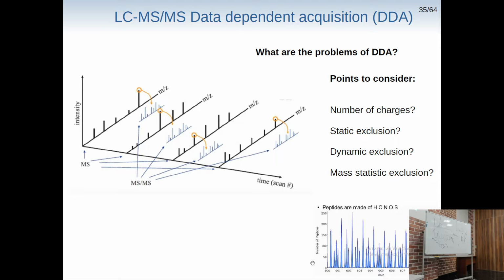Also, we want to take only at least 2 plus or 3 plus charge because it will give us better data.